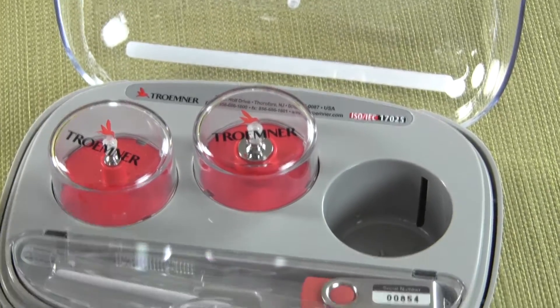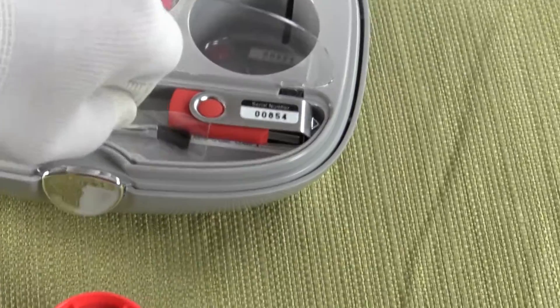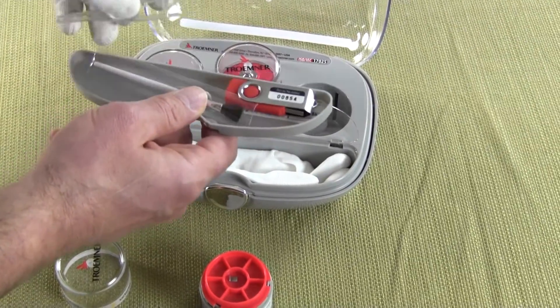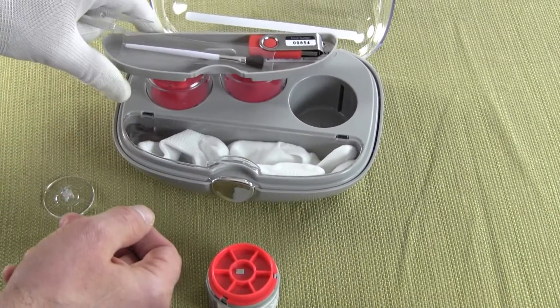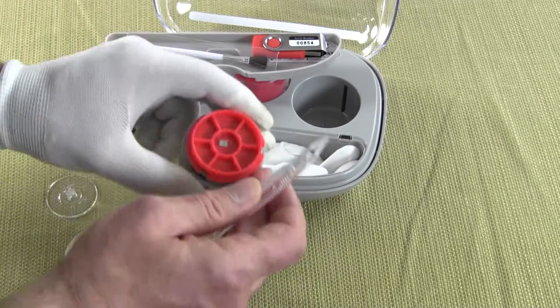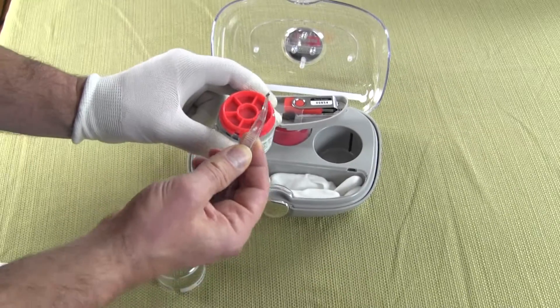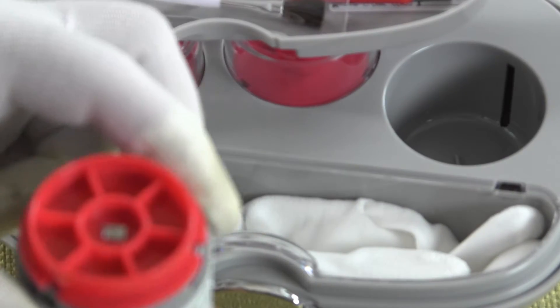This leaf weight is 20 milligrams. The kit comes with a little tray, and in the tray we have a pair of forceps. Those forceps are used to pick up the leaf weight and also the calibration weight. This leaf weight is 20 milligrams and is class 1.